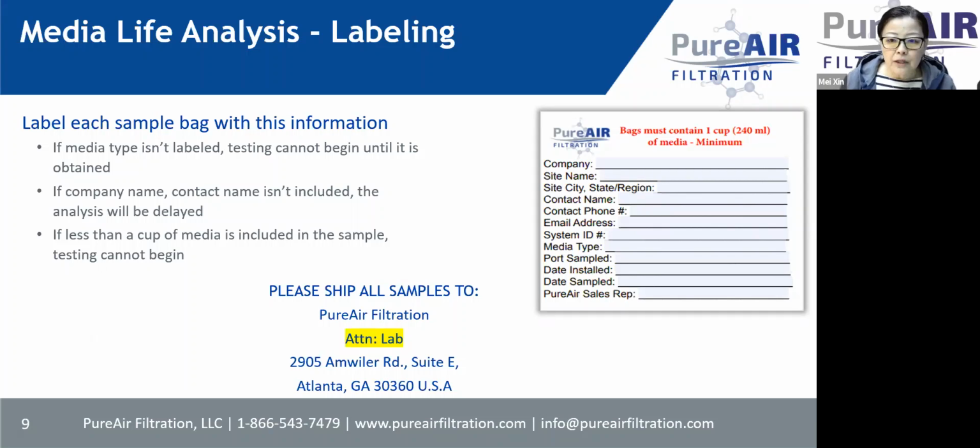After you collect all the information, we can provide the sample label to you, and it can print on all the Dymo or other printers you have. And please ship all samples to Pure Air Filtration, attention to lab. We are a small company, but still, sometimes there's communication loss. So sometimes samples don't deliver to us on time. So please put attention lab, so we can get your sample in the queue as soon as possible.